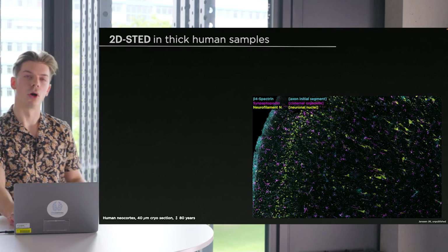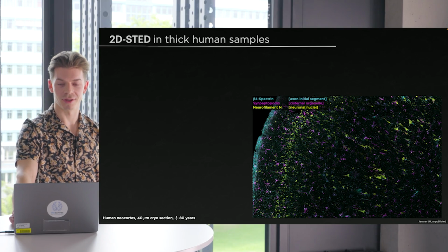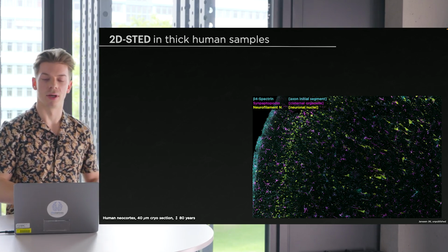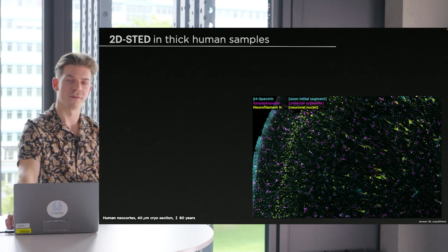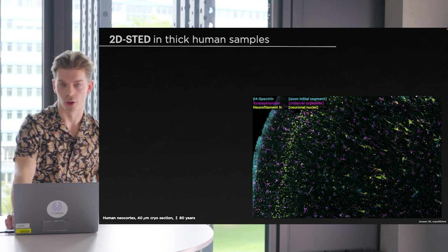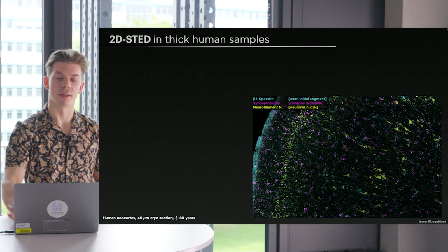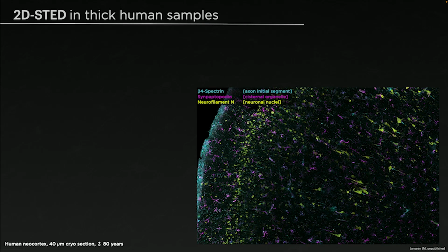After moving to Austria, we acquired a facility line from abberior here at the JKU. And we are now able to take our imaging approach to a new level, and actually also moved away from our rat and mouse models that we had into human samples that we get in a cooperation project with the Neuromed campus over here.